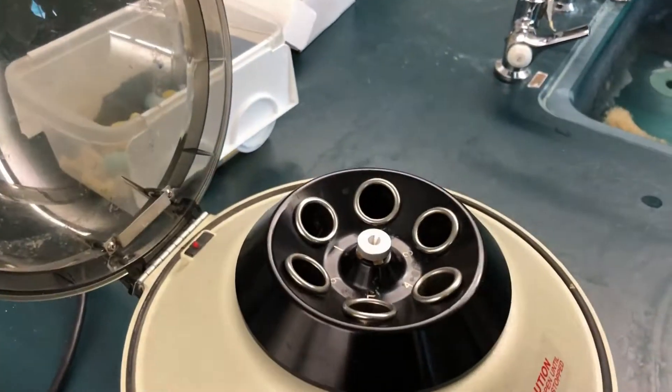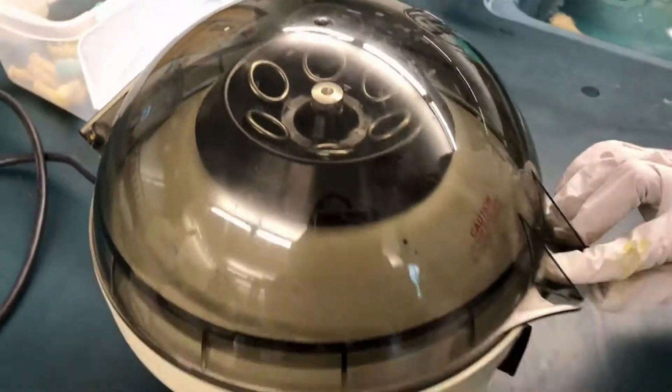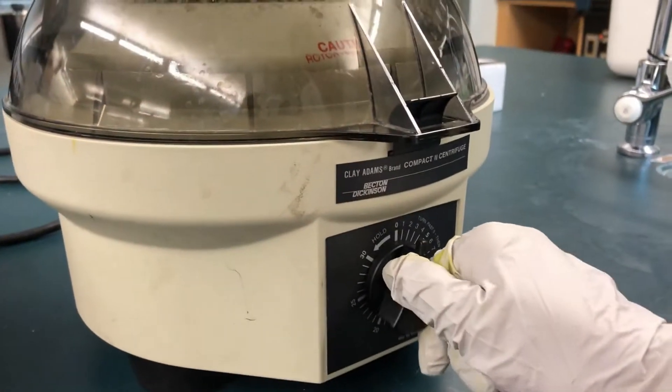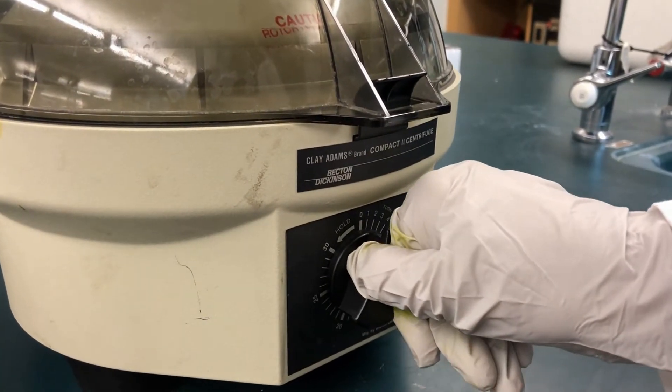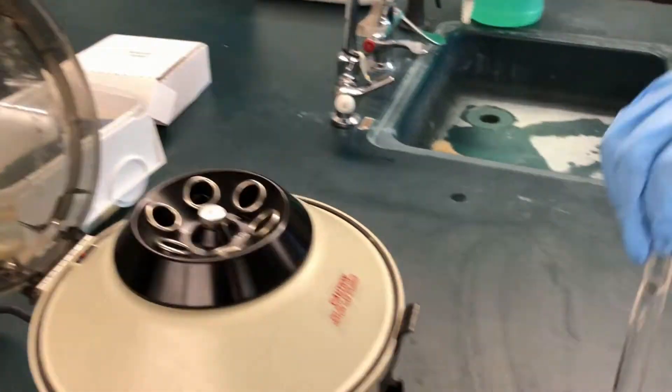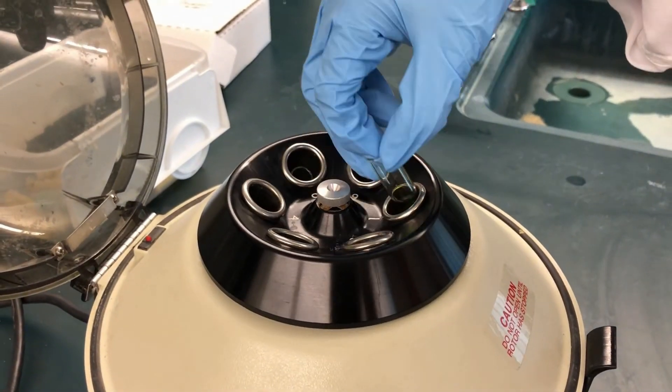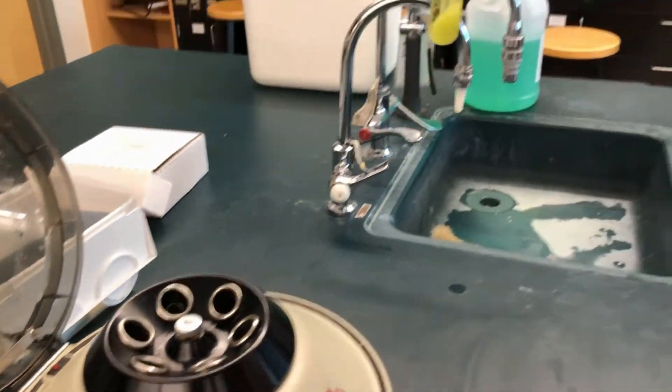Next, centrifuge for about 1 minute to separate the layers. Remember to balance the centrifuge with another test tube of equal mass or volume opposite of your test tube. After the centrifuge stops completely, carefully remove your test tube. You should see the layers leaving the petroleum ether and the pigments on the top layer.